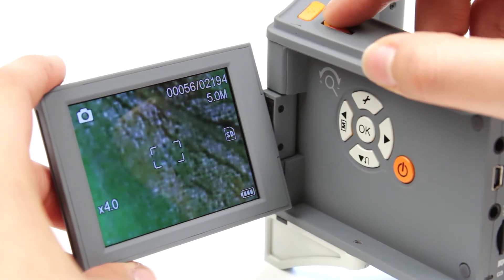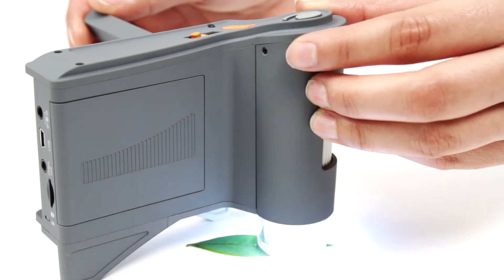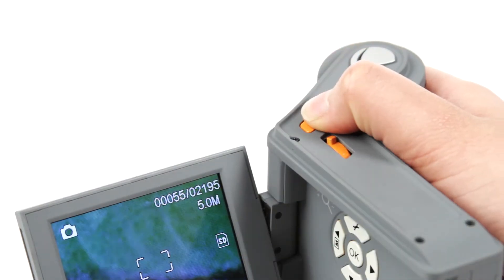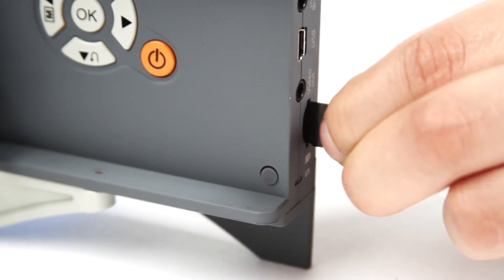Manipulate the 4x digital zoom and the adjustable illuminator to frame and light your specimen exactly the way you want. Then press the shutter button to capture still images or video. Images are saved directly to your microSD card.